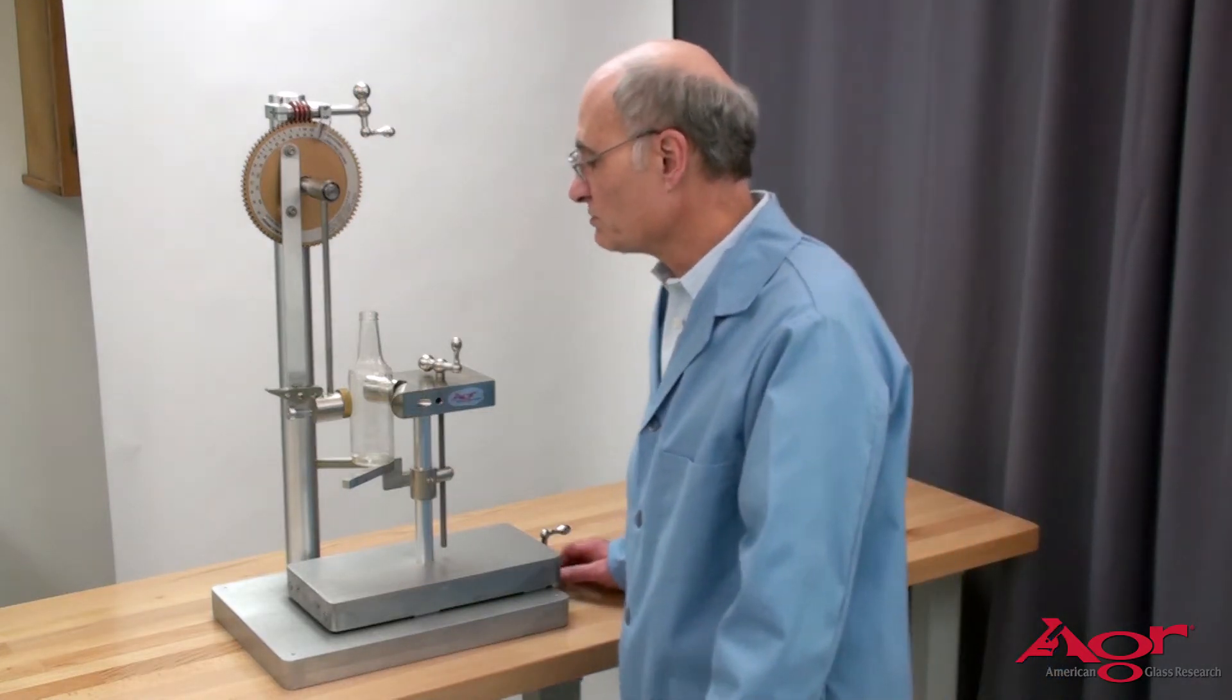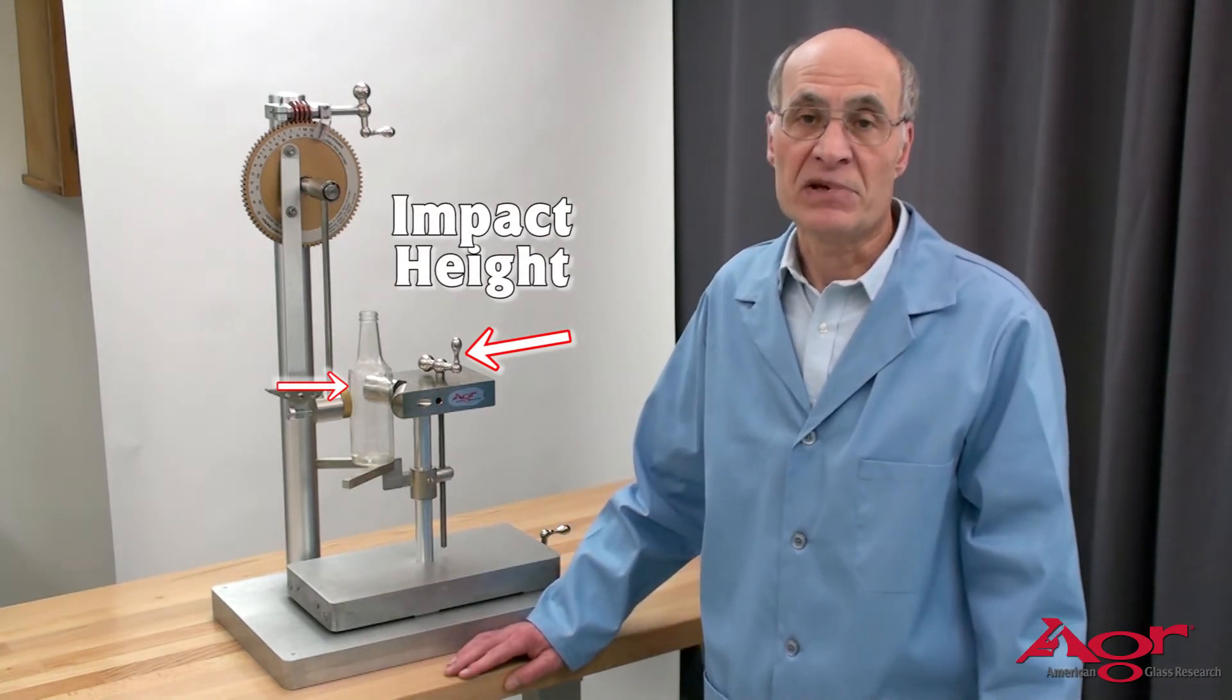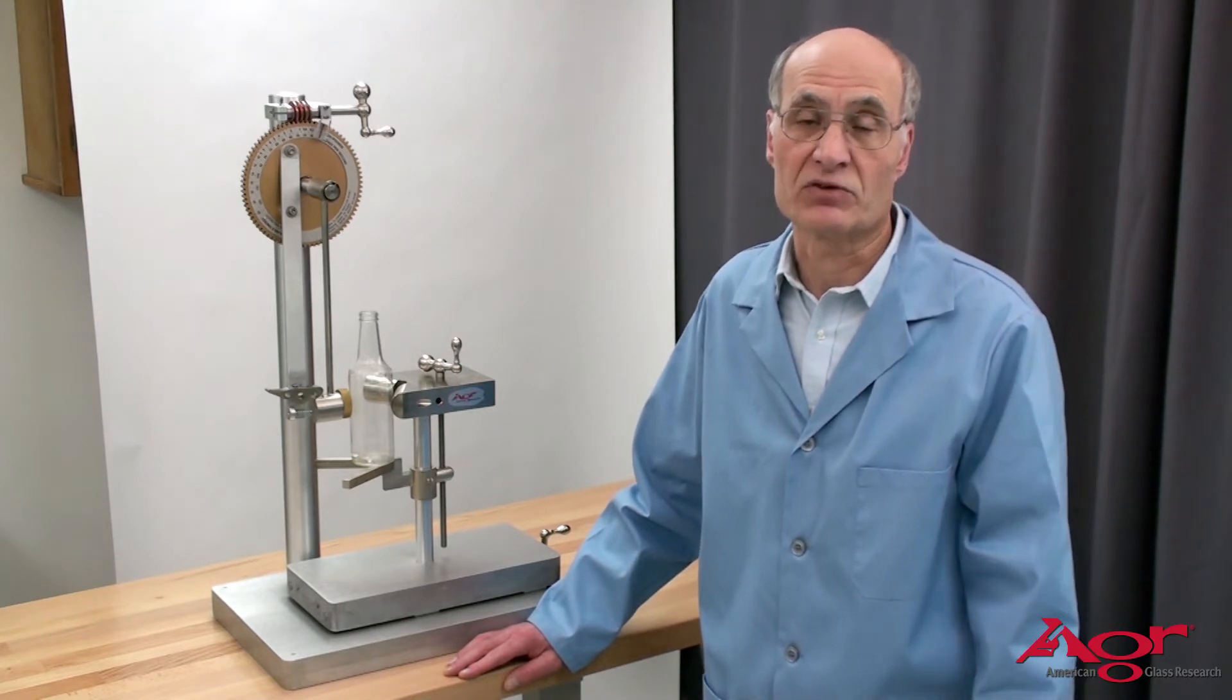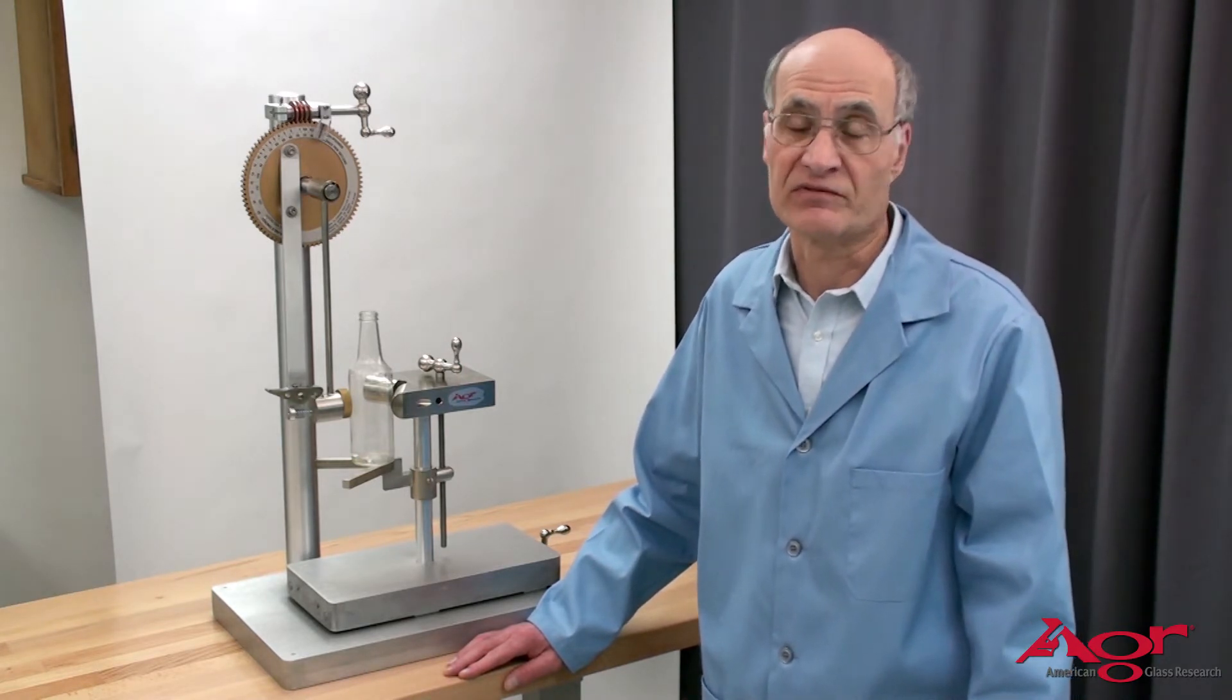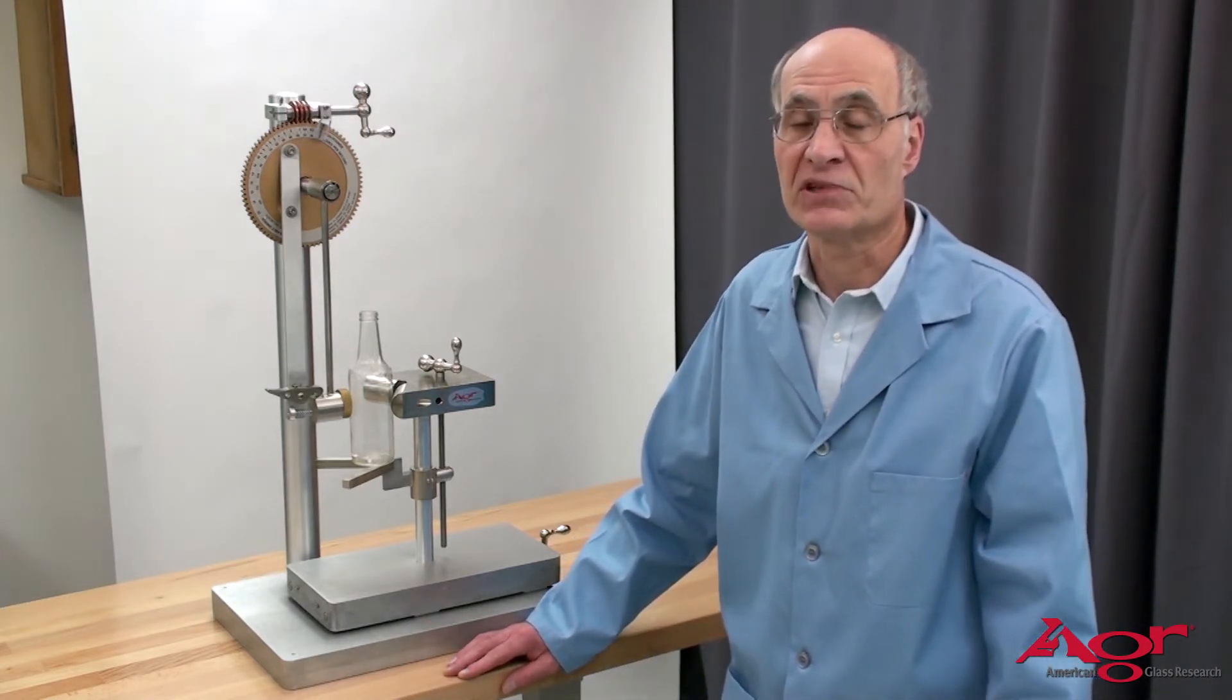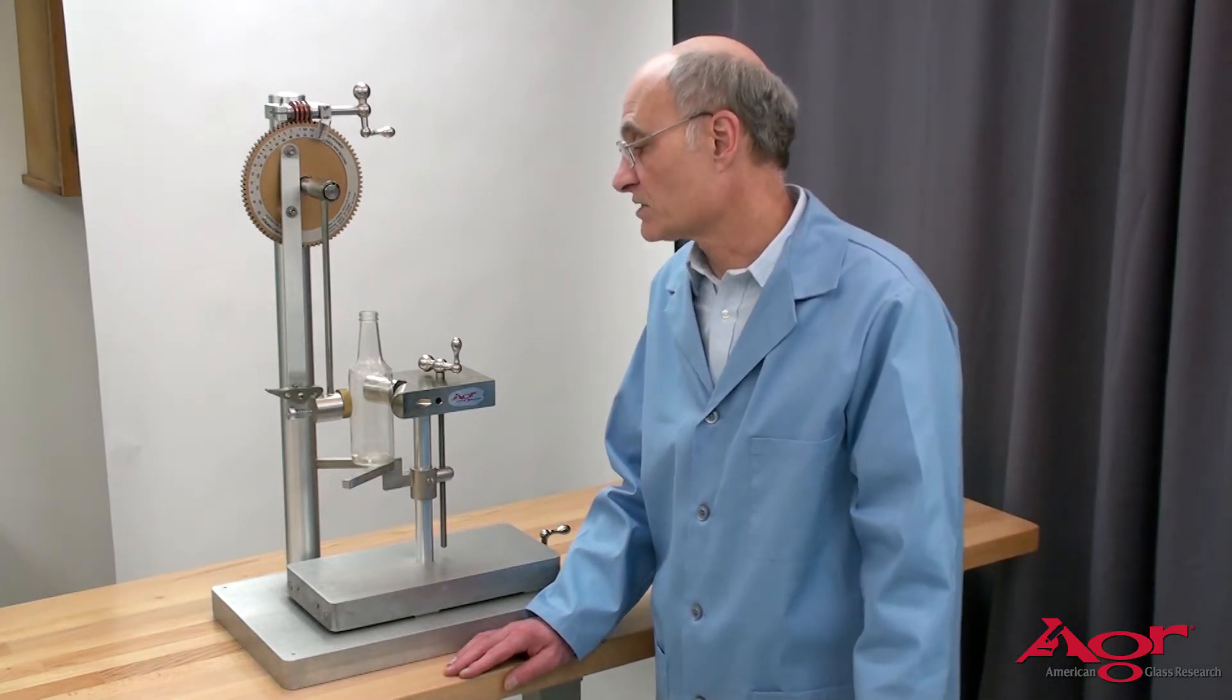The final adjustment we really want to make is for the impact height on the bottles. Impact is fairly localized so if you impact at the shoulder it doesn't have any effect on the heel and if you impact at the heel it has no effect on the shoulder. In this case we're doing an upper sidewall impact to the bottle but you can pick the impact site depending on the location you want to test.